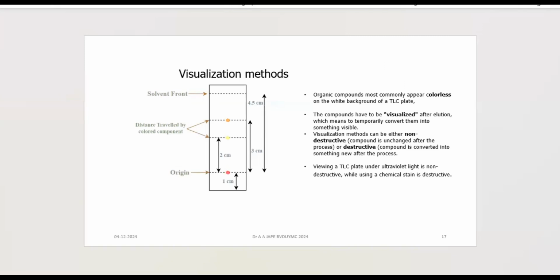Accordingly, you are going to have adsorption and desorption of the analyte on the stationary phase and within the mobile phase. The analyte is going to move faster if it interacts more with the mobile phase.